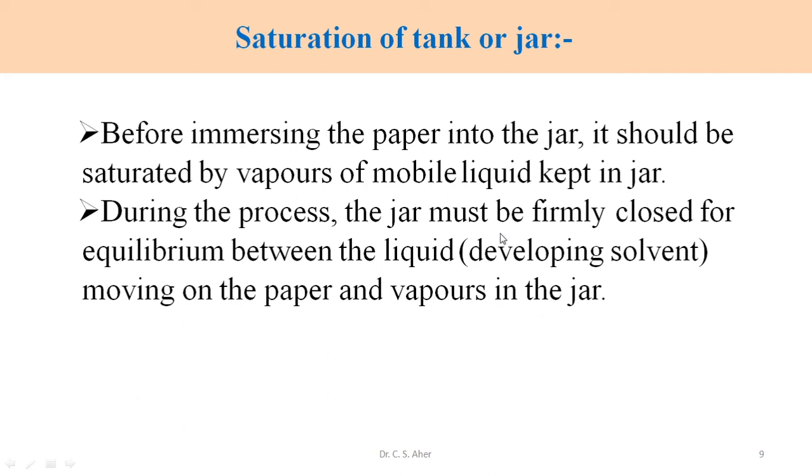During the process, the jar must be firmly closed, for equilibrium between the developing solvent liquid moving on the paper and the vapors in the jar. So there is equilibrium between that liquid vapor present in the jar and on the paper.